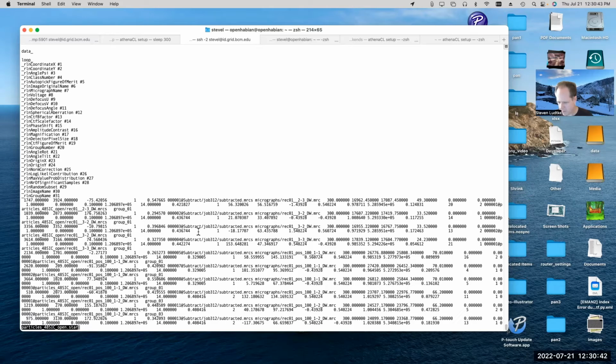So if you want to write a program to read the star file and read out the information about the 50,000th particle in the file, there's no good way of jumping immediately to the 50,000th line. You have to actually parse through the entire file until you get to line 50,000, and then you can read the parameter out.